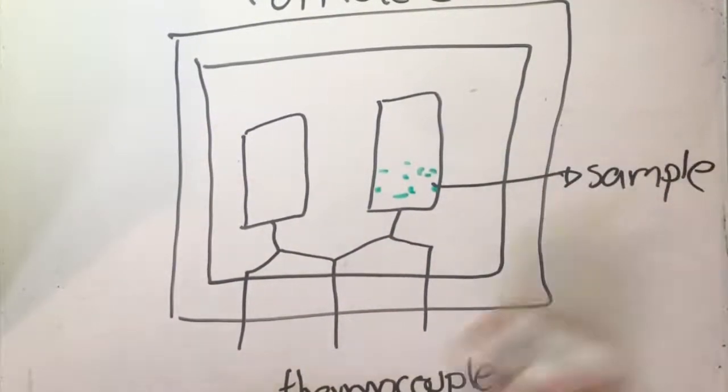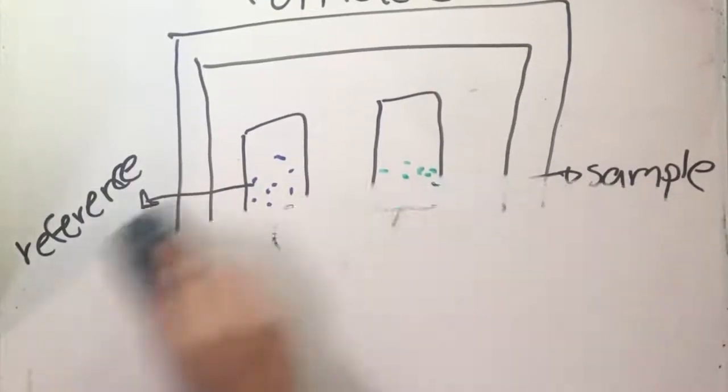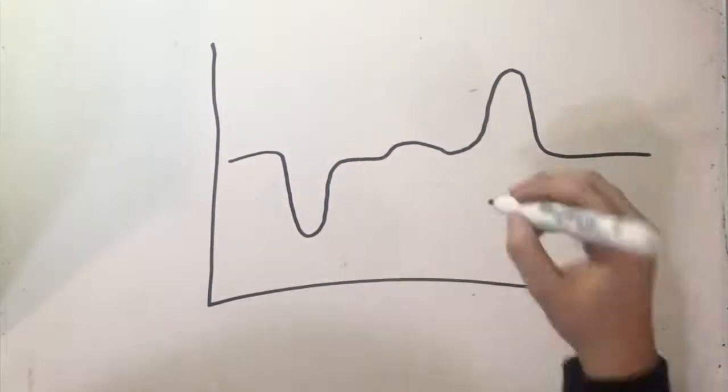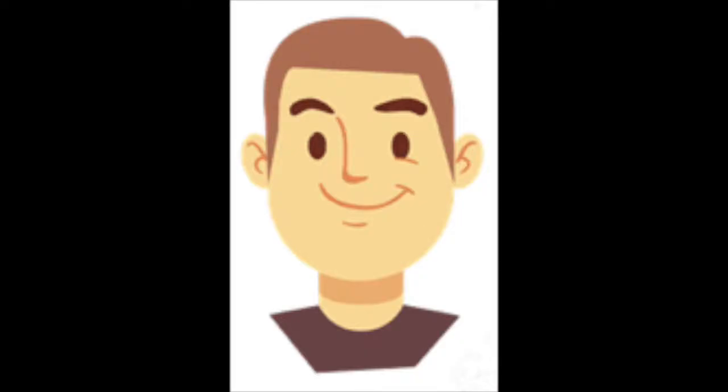This change occurs because the input energy transmitted through the thermocouple affects the latent heat of the sample during the phase change. However, after this occurs, the heat is incorporated to the analysis. With this, you can obtain a thermogram of your sample that will show the phase transition, including the glass transition temperature. I didn't know that thermal properties were so important.